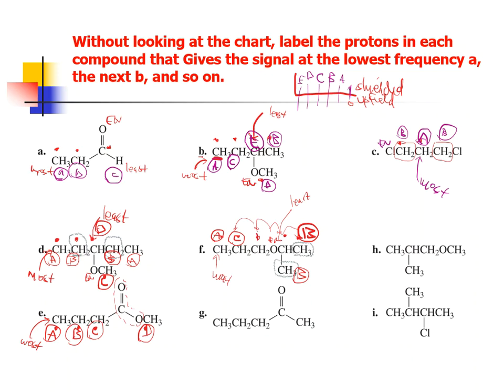So that means the D would come from those protons, and the E will come from that 1 proton beside the oxygen. That E proton is the most deshielded out of the bunch. The electron cloud is very low, and that exposes the proton to the magnet of the NMR more so, which means more frequencies required in order to get that to flip and off the swing set.